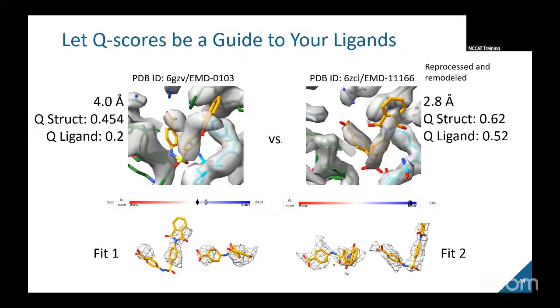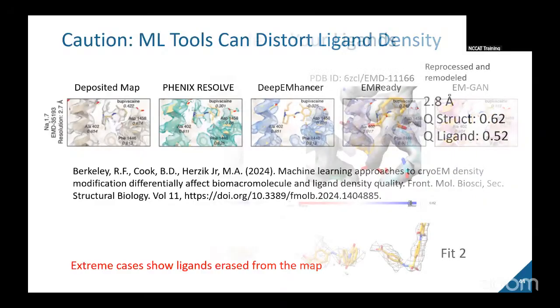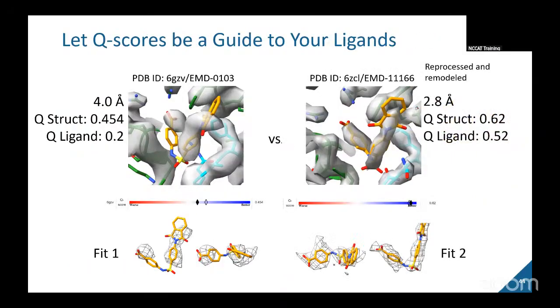We are only starting to explore that, and actually I have a slide on ligand Q-score distribution across resolution bins. We're getting into it now, doing these more systematic studies. It's still a question that I think hasn't fully matured because there are many factors. We have to think about what's in the archive currently and the representation within each of those bins, things like this. But there are some interesting trends. I keep putting you off, but if you give me a moment, yeah.